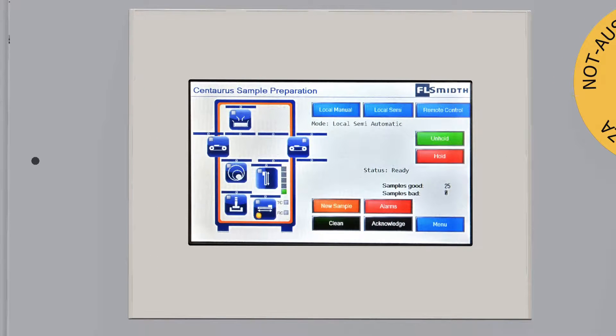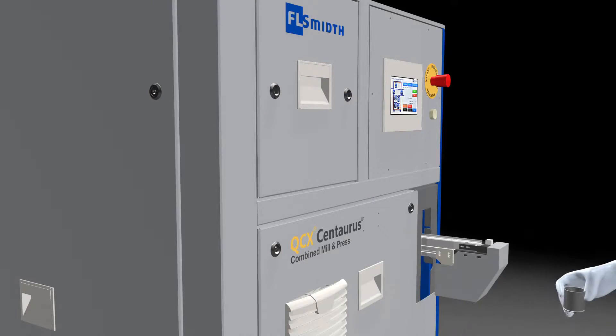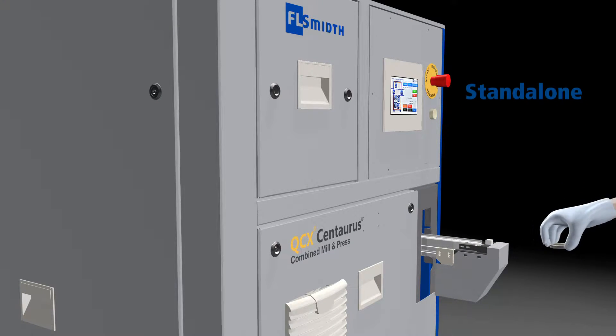The Centaurus can be controlled by a touch screen. The Centaurus V2 automatic mill and press can be used in three different setups. Standalone — for use as an independent sample preparation tool.